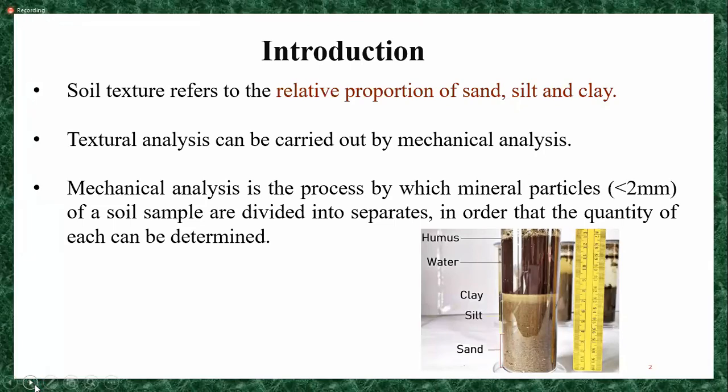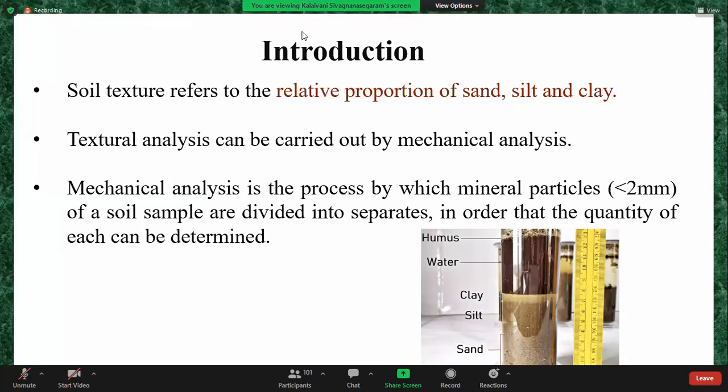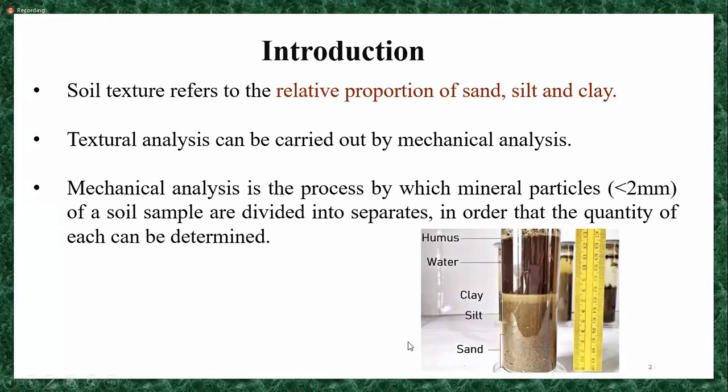Sorry, I couldn't hear you. What are the methods? Any one of you? Hydrometer. I couldn't hear you, sorry. Can you please say it loudly? Field method. Okay.